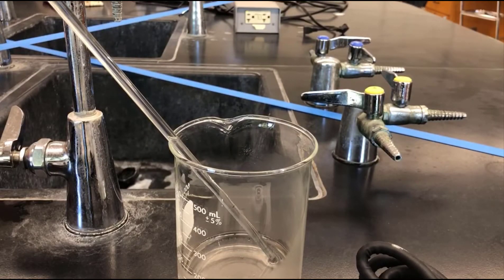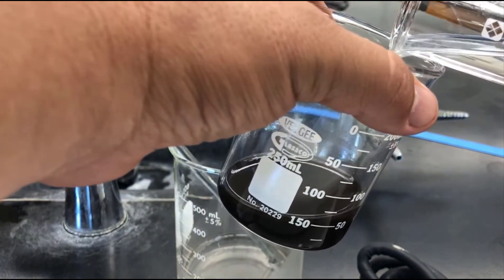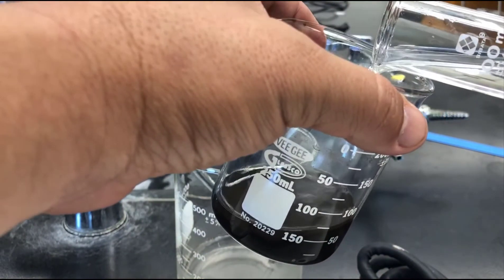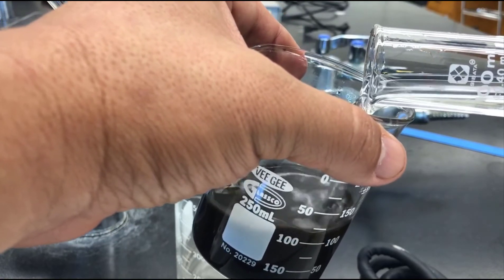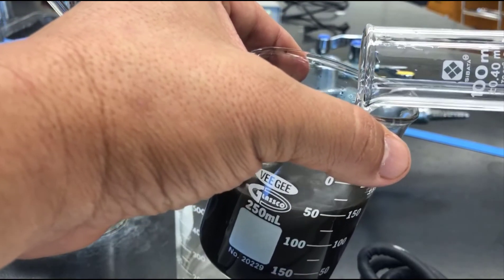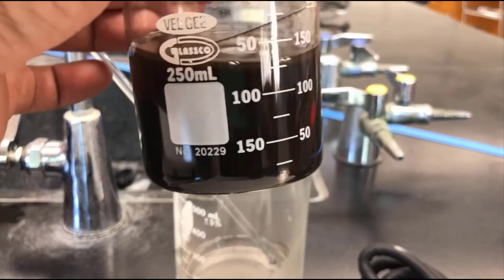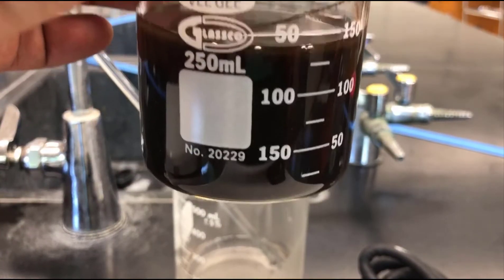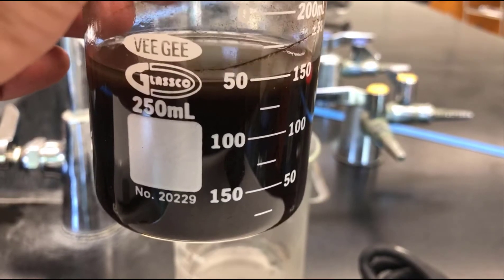Another thing to keep track of: things go a lot faster if you have things ready to go. Have the 100 mLs of water prepped before you need it. You can see that's all cloudy again, so we're going to give it a few minutes to settle and then we'll decant it again.